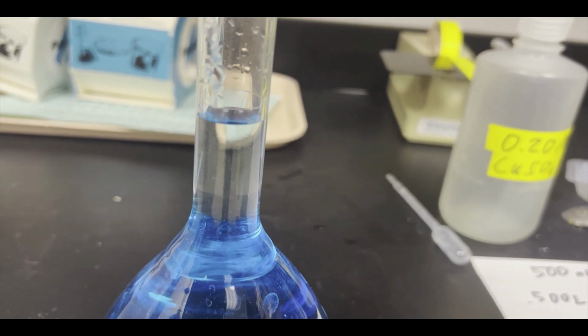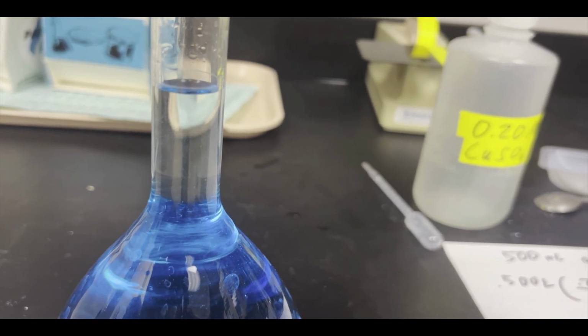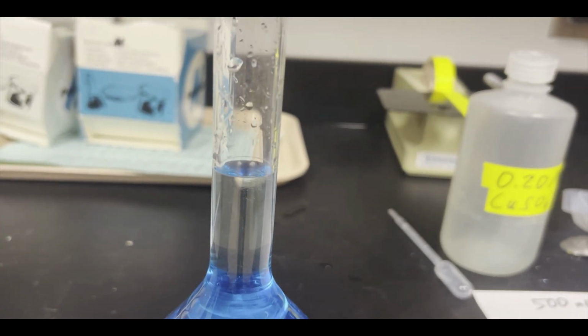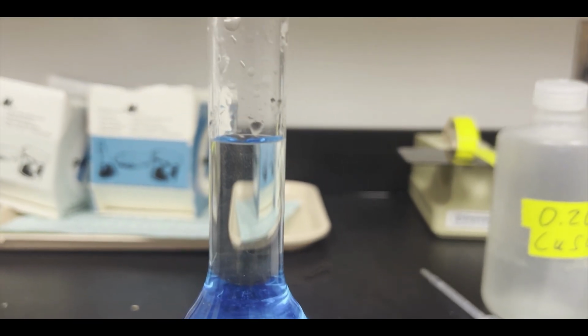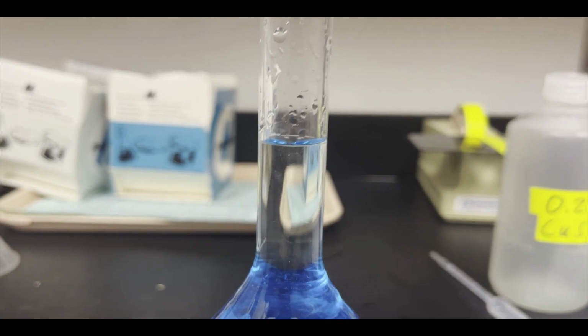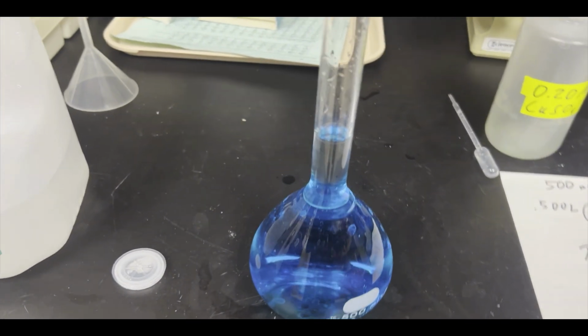So you notice I'm going nice and slow, making sure I don't go past that line, because there really isn't a perfect way to fix it if you go past the line. And there I am. So you see how now the bottom of the meniscus of the water matches that line exactly, okay? So now I have created my solution.